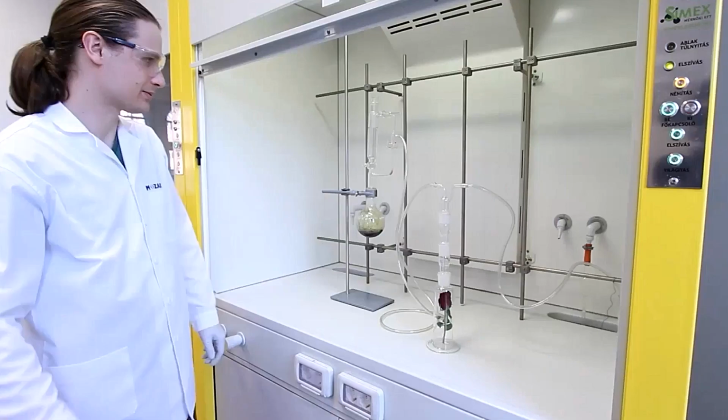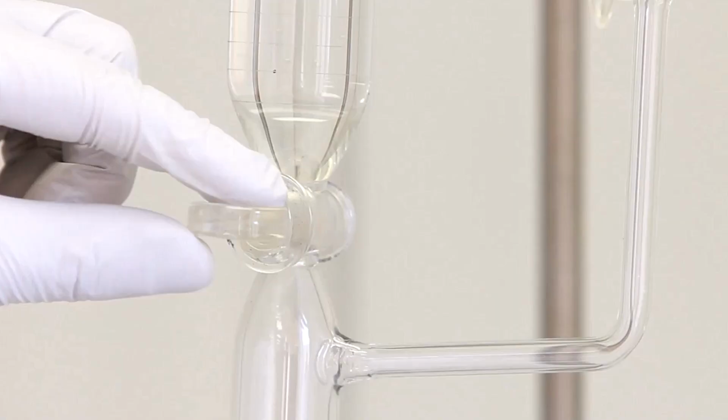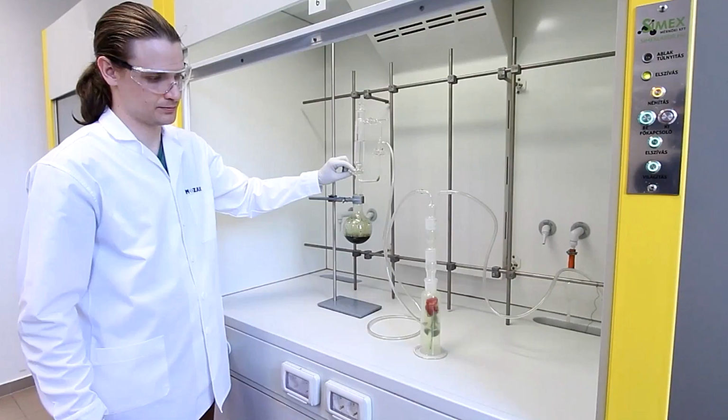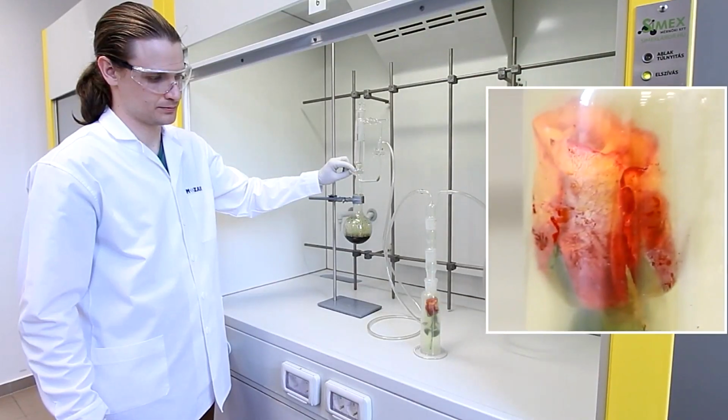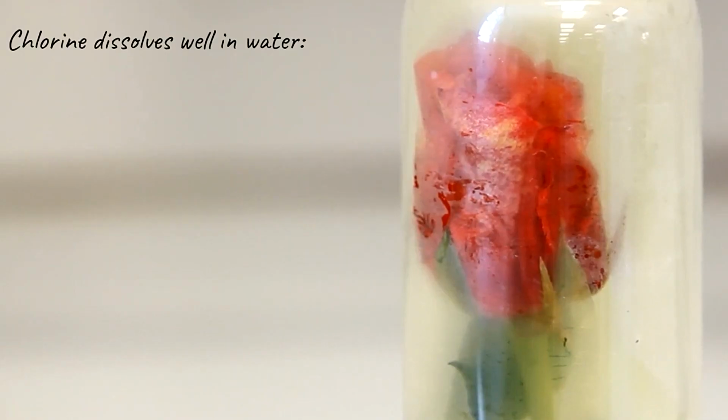With all the equipment set up, and with the potassium permanganate in the flask, we can carefully add the hydrochloric acid to it. As it comes into contact with the yellowish-green chlorine gas, the rose in the glass cylinder soon loses its color. But what lies behind this process? Chemistry gives us the answer to that question as well.